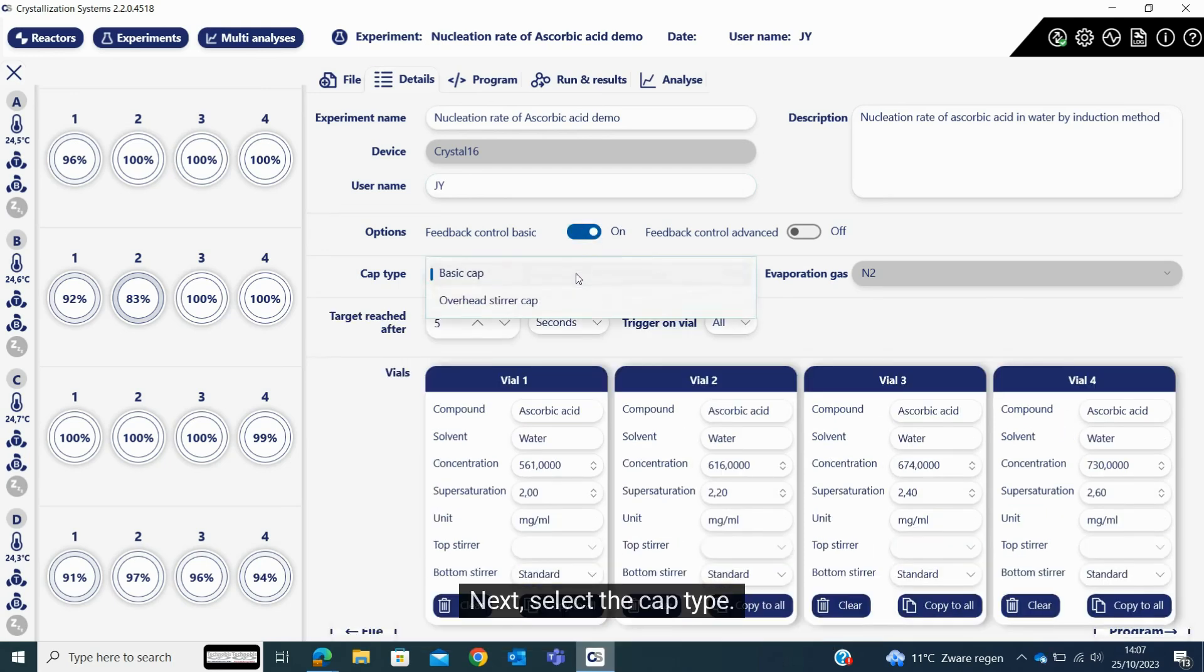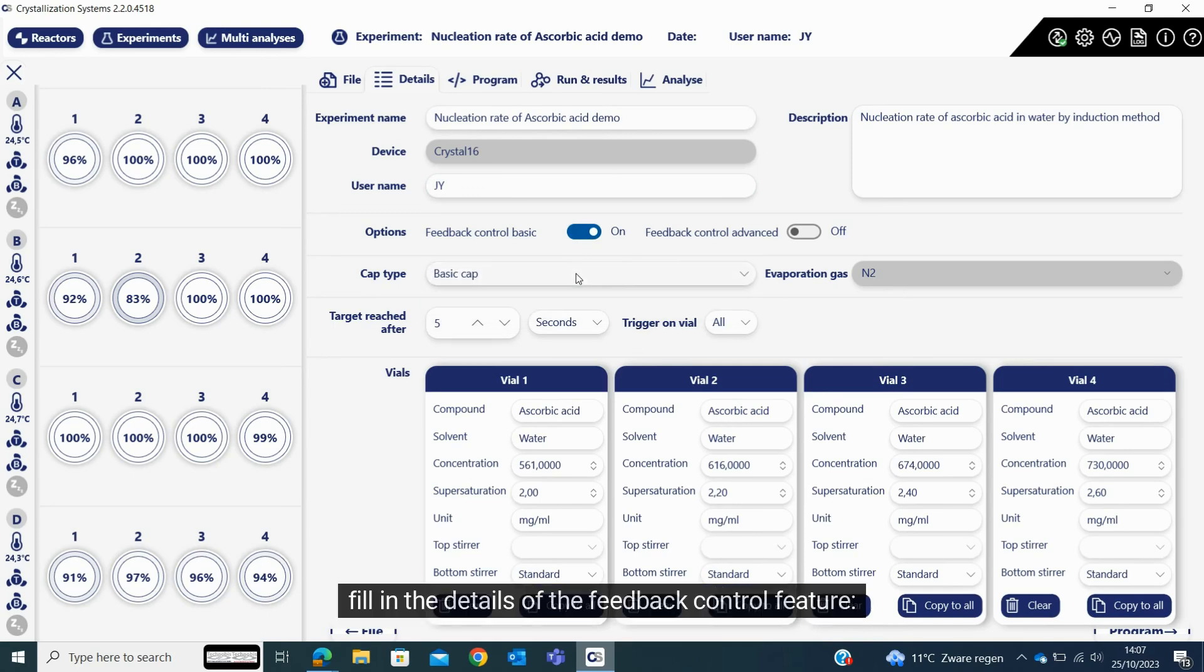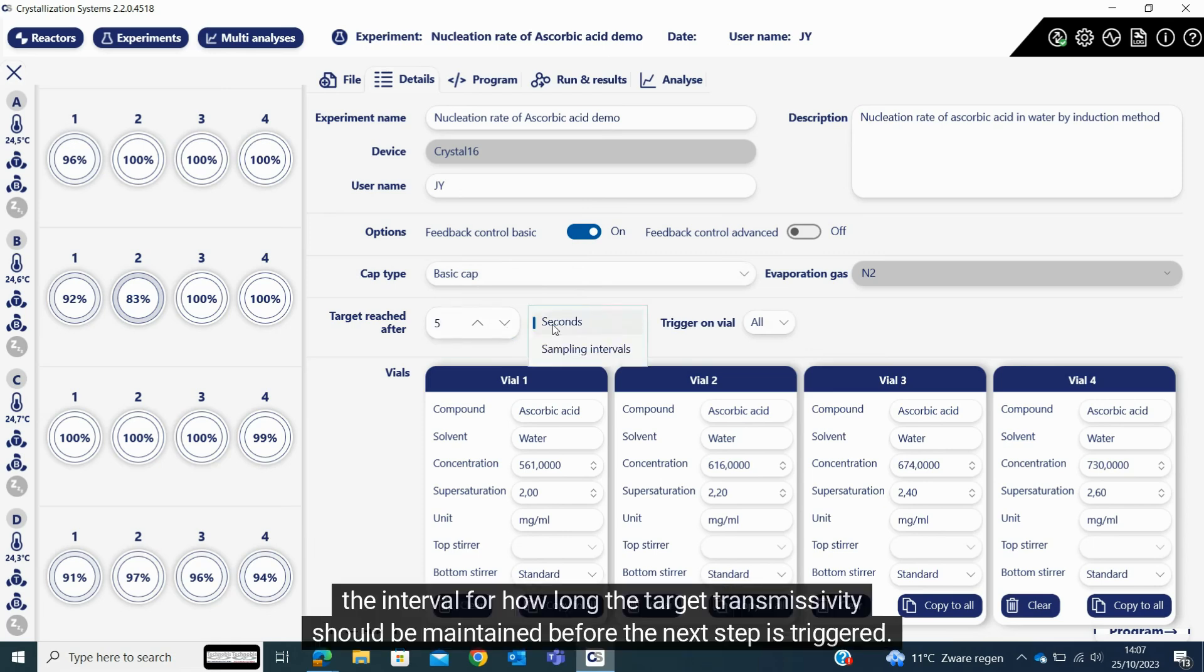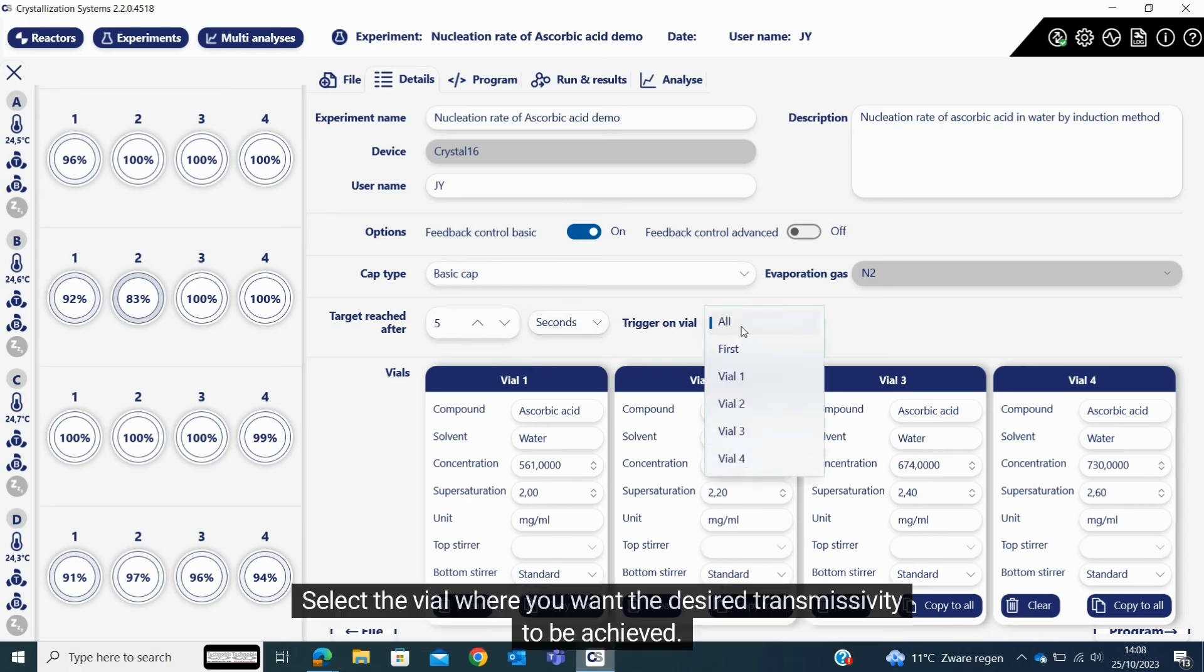Next, select the cap type. Fill in the details of the feedback control feature. The interval for how long the target transmissivity should be maintained before the next step is triggered. Select the vial where you want the desired transmissivity to be achieved.